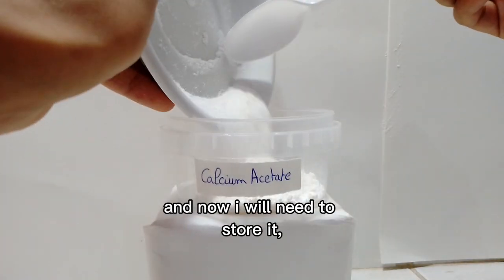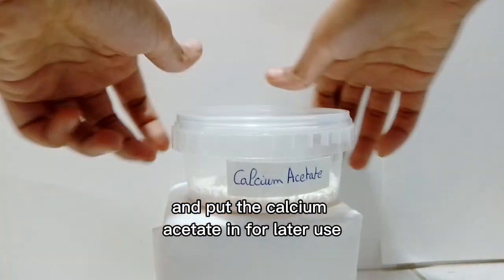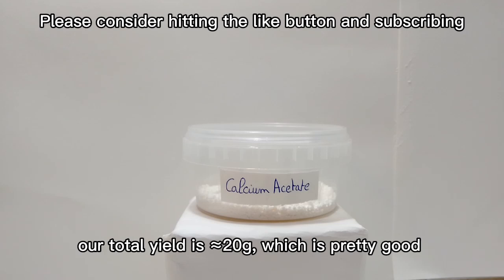Now I will need to store it. I chose a container, labeled it, and put the calcium acetate in for later use. Our total yield is 20g, which is pretty good.